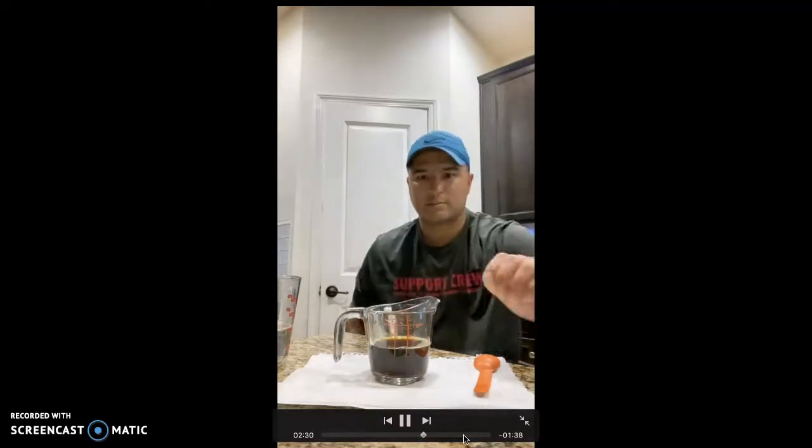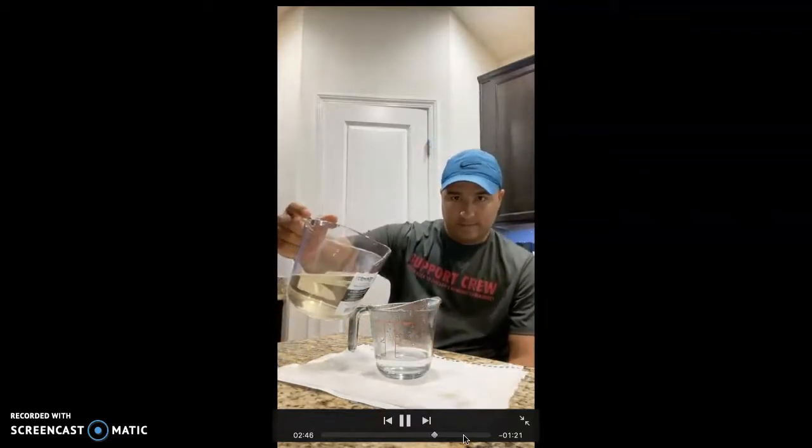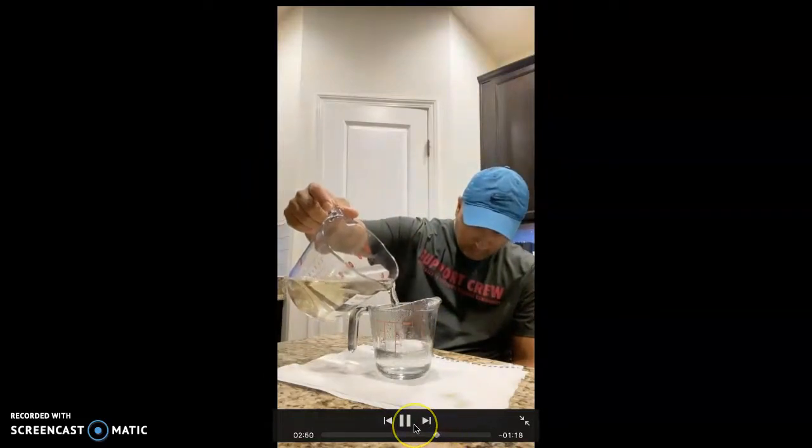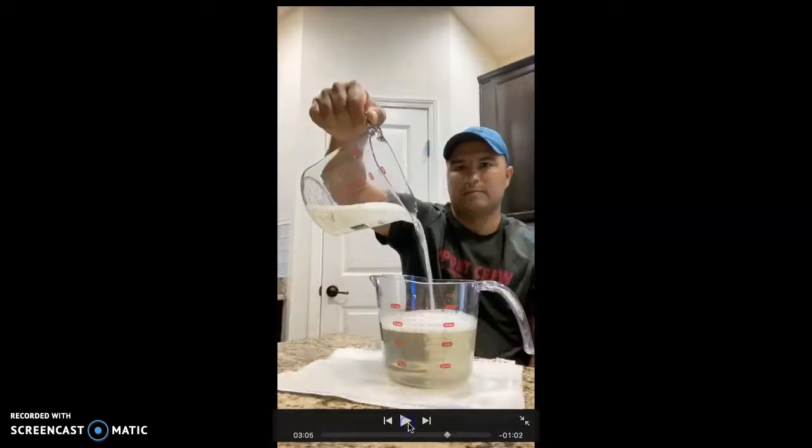The rate of the reaction can be affected by temperature. For example, on this part right here, I heated up one solution, which is the one with the starch. I put it in the microwave for about a minute, and then I mixed the solutions. And this time, the solution only took about, I don't know, a few seconds to change color. As with the previous one, you noticed that it took about a minute or so to change color, so it took a while.